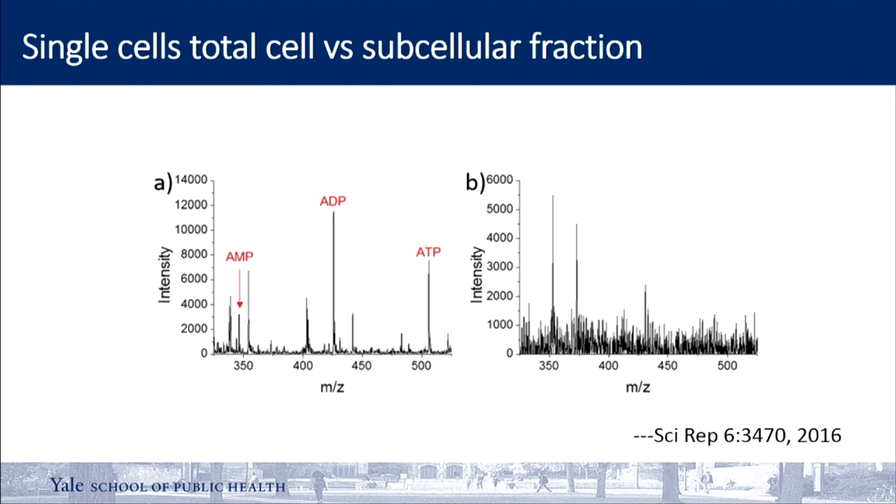So there are a lot of challenges again in these approaches. Low abundance of molecules, low volume in most cases. And the other important thing is we don't have all these databases that we can utilize to identify all the m/z signals that we're getting in here. We're getting there, but it's not there yet.